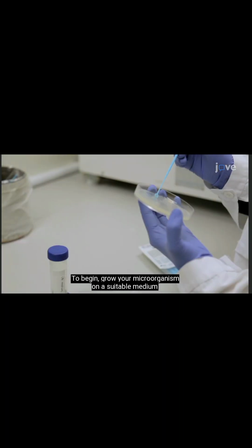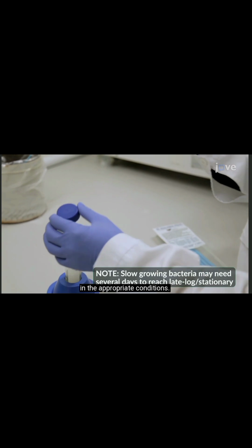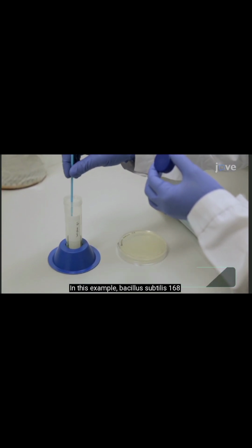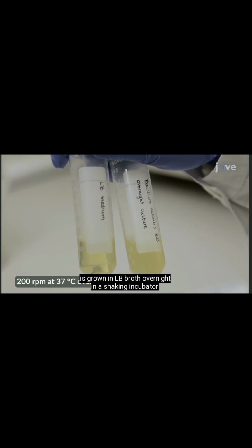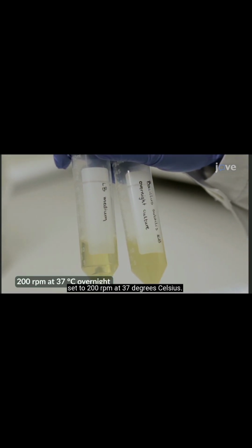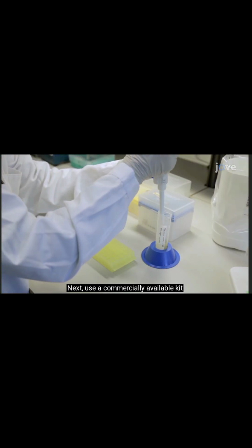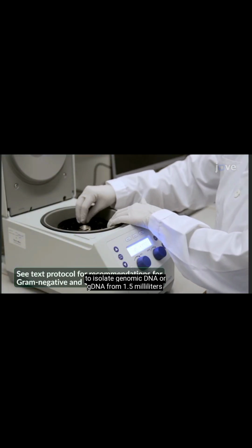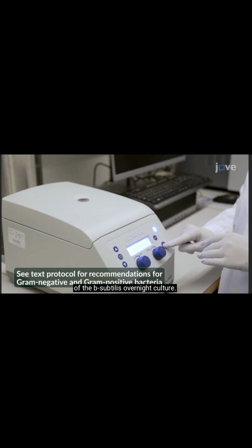To begin, grow your microorganism on a suitable medium in the appropriate conditions. In this example, Bacillus subtilis 168 is grown in LB broth overnight in a shaking incubator set to 200 RPM at 37 degrees Celsius. Next, use a commercially available kit to isolate genomic DNA, or gDNA, from 1.5 milliliters of the B. subtilis overnight culture.